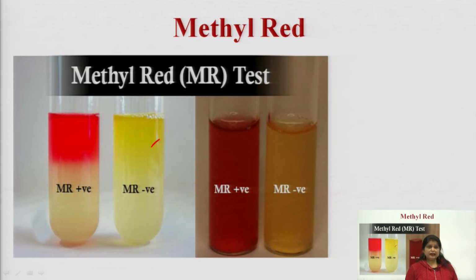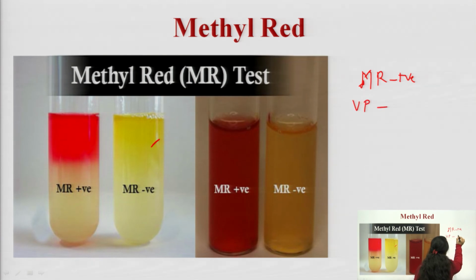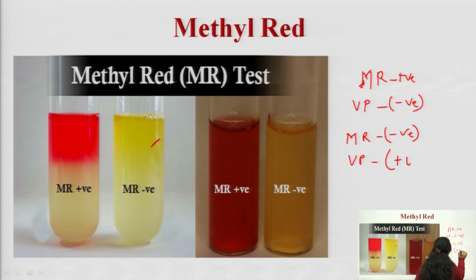Along with that, I would like to tell you that the bacteria which give MR positive results will give VP negative results. If MR results are positive, then the VP result will be negative. But if MR results are negative, then VP results will be positive.